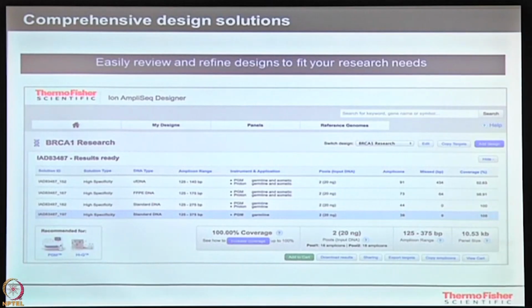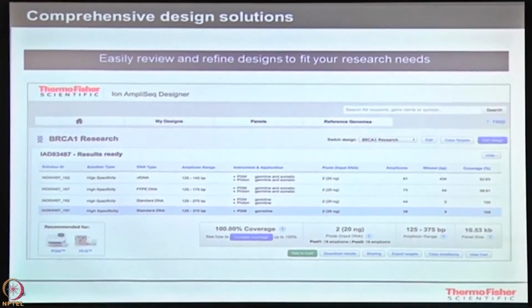So such types of samples or such variations are available over here to know what can be done. There's one more type of sample that comes up in cancer studies. Have you heard about the FFPE sample anytime? Yeah. These are actually formalin fixed samples. Okay.